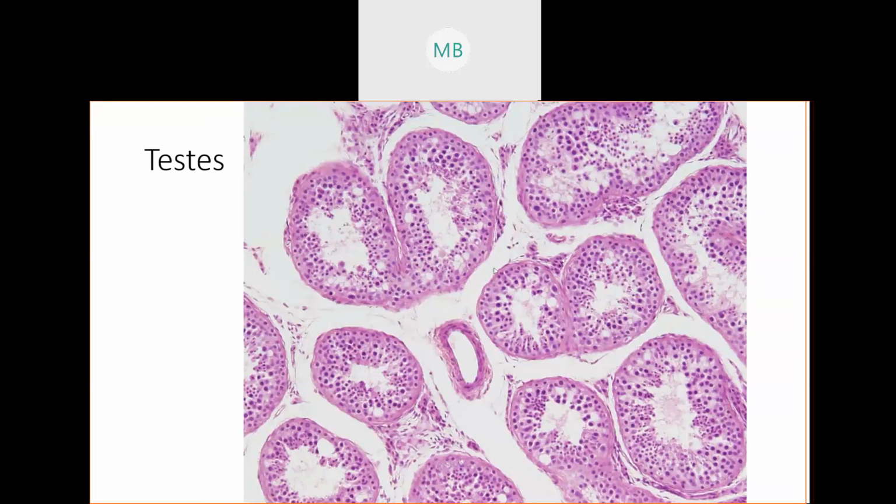And here we have testes. This may come as a shock to some of you, especially my gentlemen, but the testes are actually a cluster of tubes. So if you see this weird conglomerate here of what looks like a lot of tubes and a lot of space that's just holding these tubes together, congratulations! This is what your testicle looks like under a microscope.